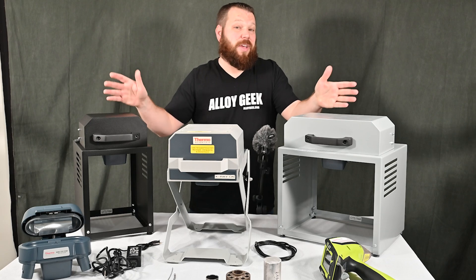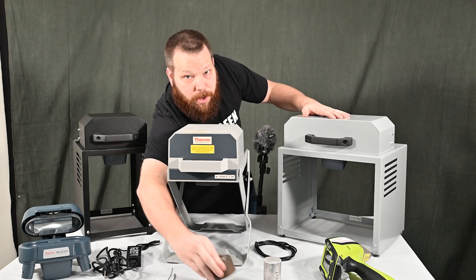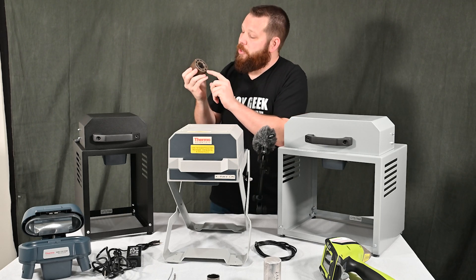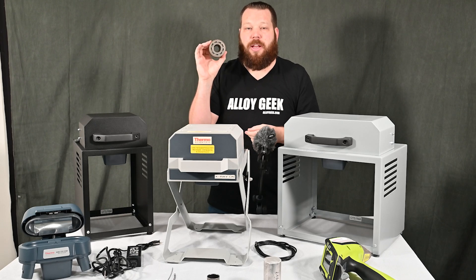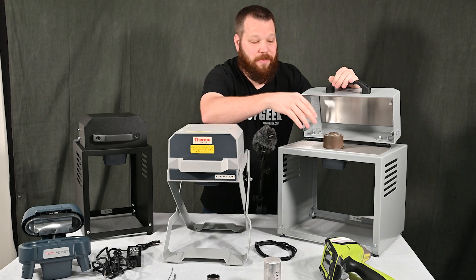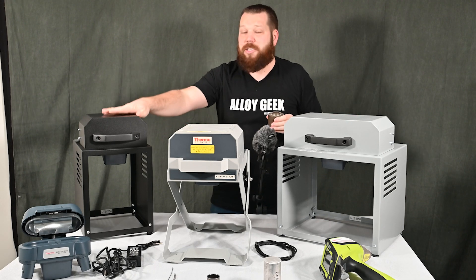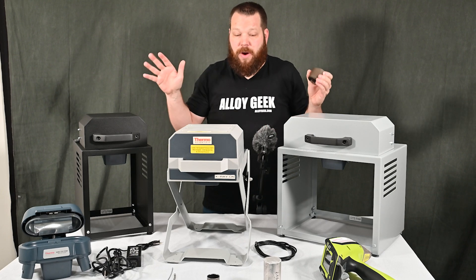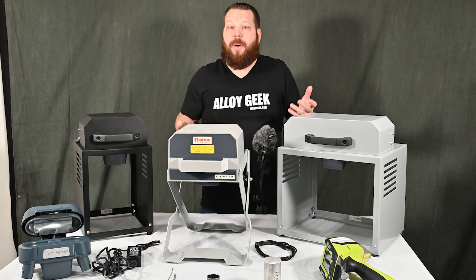Another big reason to use a test stand — whether you have a camera feature or not — is you can target specific areas on a sample. On production parts like this hydraulic cylinder, there are different machined regions, and I can target very specific regions with a test stand by simply moving the sample on the sample stage without having to move my XRF around. I can also run that completely from a computer, which is another huge benefit — download the data right there, it's just a very easy way to do analysis with handheld XRF.